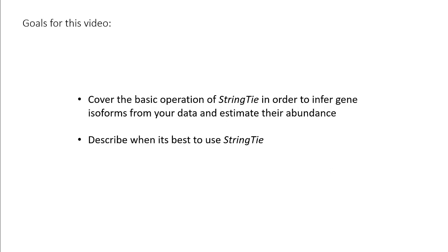The goals for this video are to cover the basic operation of Stringtie for inferring gene isoforms and calculating their abundance. Also to describe when best to use Stringtie.